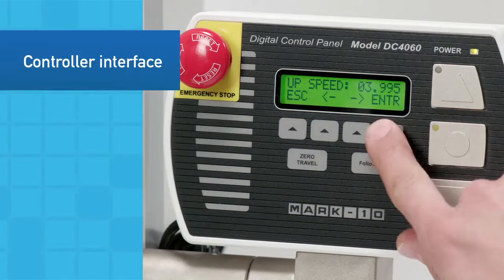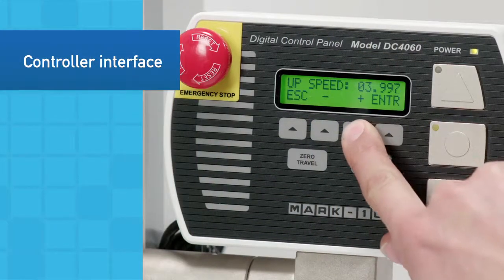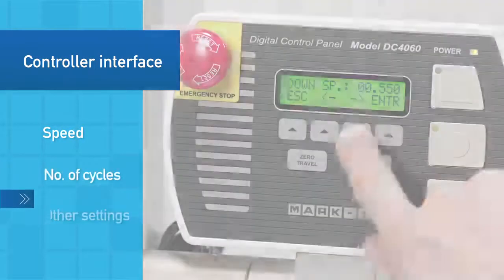Utilizing the simple control panel interface, set up test parameters such as speed, number of cycles, and other settings.